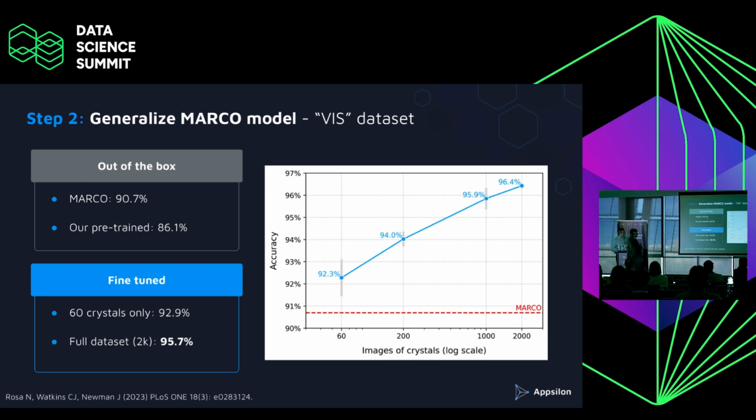Yeah, the Marco benchmark is like 91% on this data, right? But basically, with our LoRa fine-tuning of our models, it's enough to take 60 images from this data set to already get to the level of roughly 92, 93%. I think it's actually 93. It's an old graph that I showed here. So basically, we're already at the human performance level, so to speak.